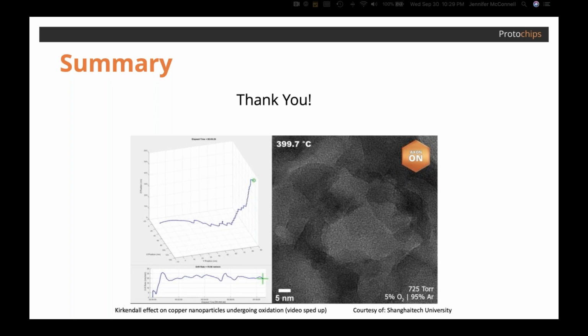So if over the course of an experiment that ran for an hour or 2 hours, there was a particular segment, they could tag that segment, and it's basically set aside in the software, and then it can be identified and more easily transferred in its own succinct little package to the end user.